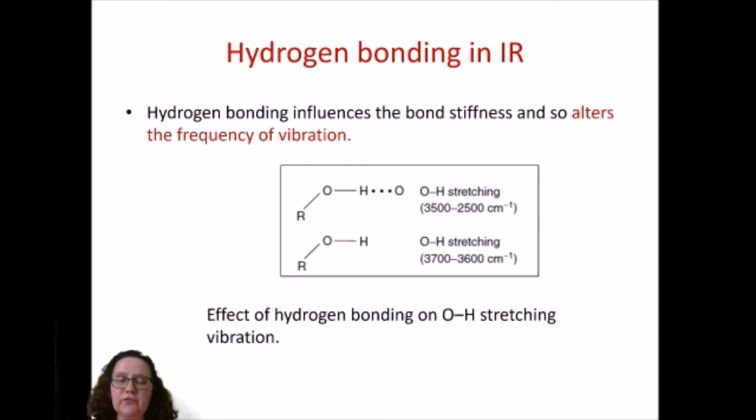If you compare, for example, the region of the spectrum in which the OH stretching mode appears without and with hydrogen bonding, it can really shift the band. When the hydrogen bond is especially strong, like for example in carboxylic acid, as I've mentioned before, it can be quite indicative, and sometimes it moves to overlap with other bands that are already there, in this case the carbon-hydrogen bonds stretching modes.